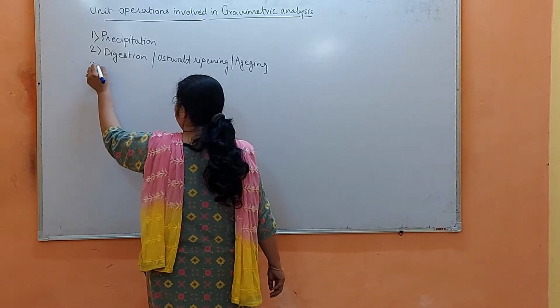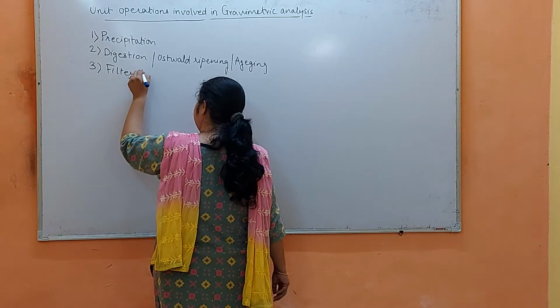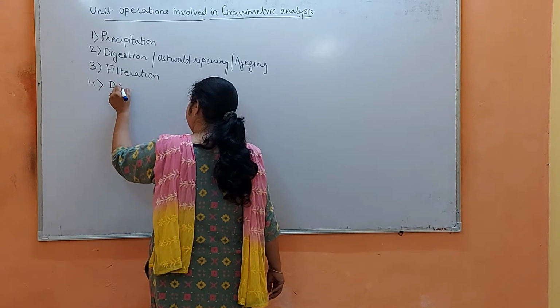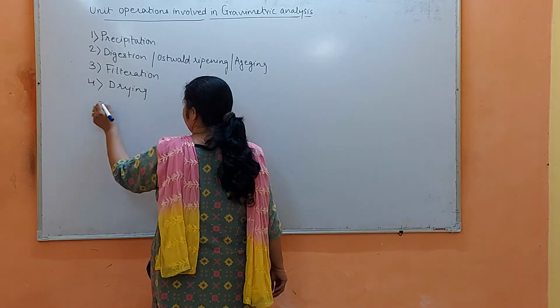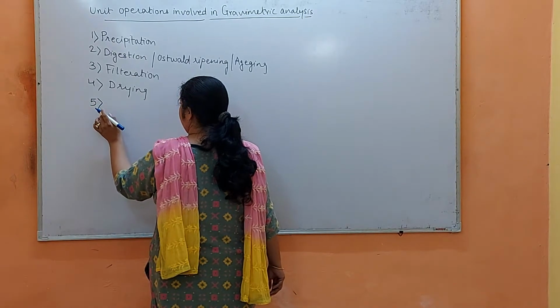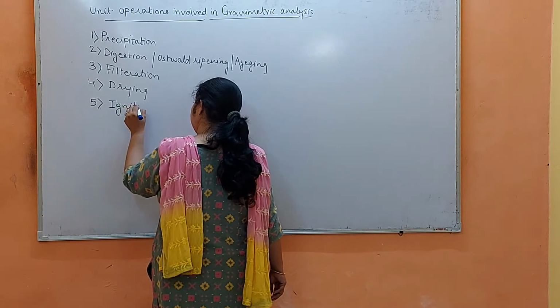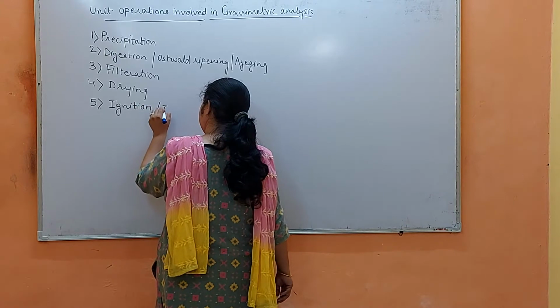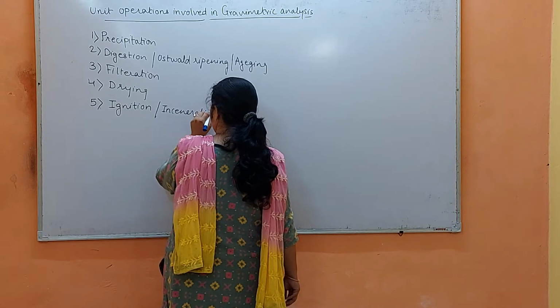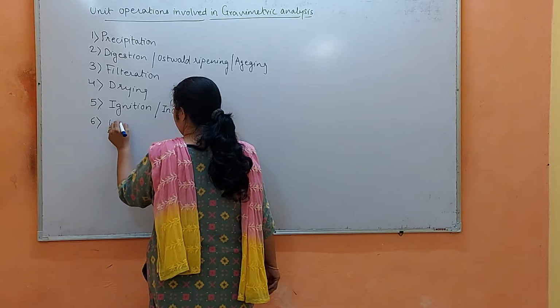Then comes filtration, then comes drying, then ignition or incineration, and sixth one is weighing.